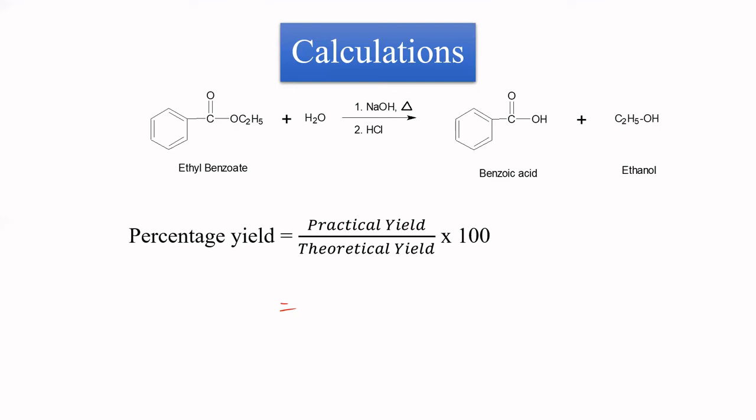Selection of a solvent for any crystallization process is completely a trial, you can say trial error method. So you have to try different solvents and you need to check. So whatever the compound you have, with the help of a small amount of compound, you can see the solubility of the compound in that solvent, and then you can decide a perfect solvent for the crystallization.